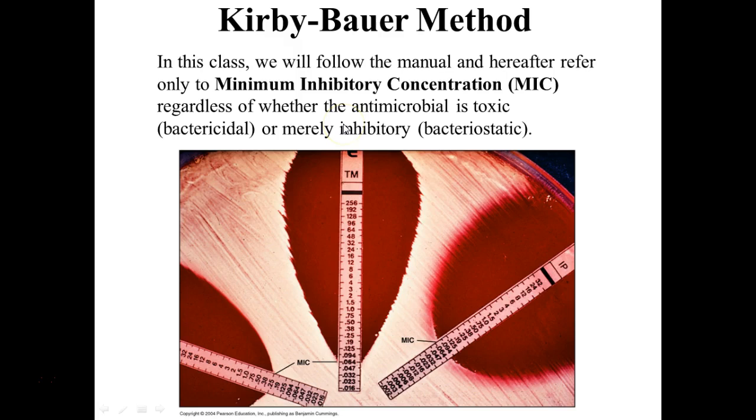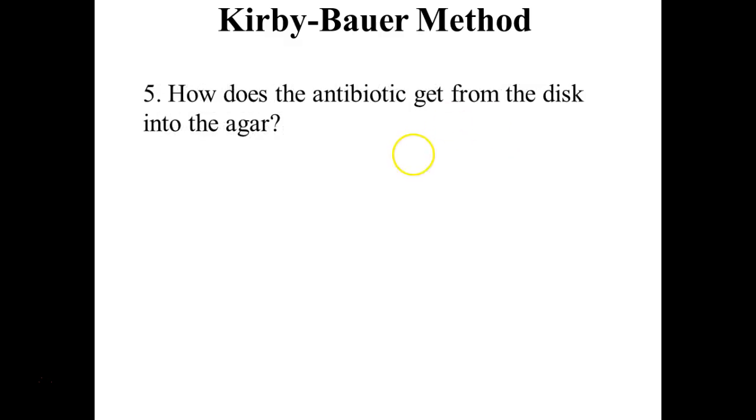So minimum inhibitory concentration, regardless of whether the antimicrobial is toxic, which is bactericidal, or merely inhibitory, bacteriostatic. Some people get real tricky and real specific on the terminology. We're not going to get too picky about it. Okay. So how does the antibiotic get into the media?